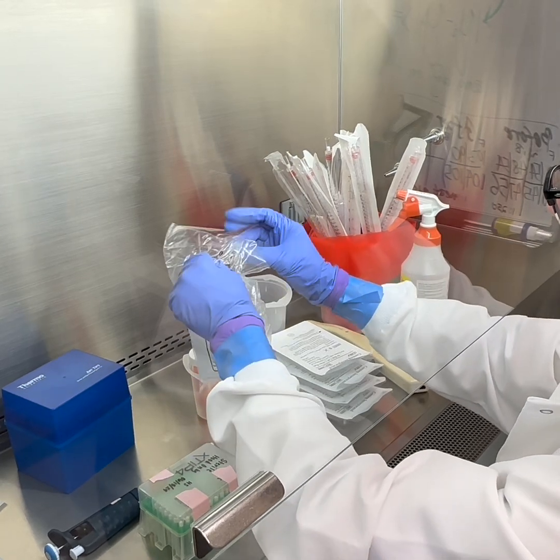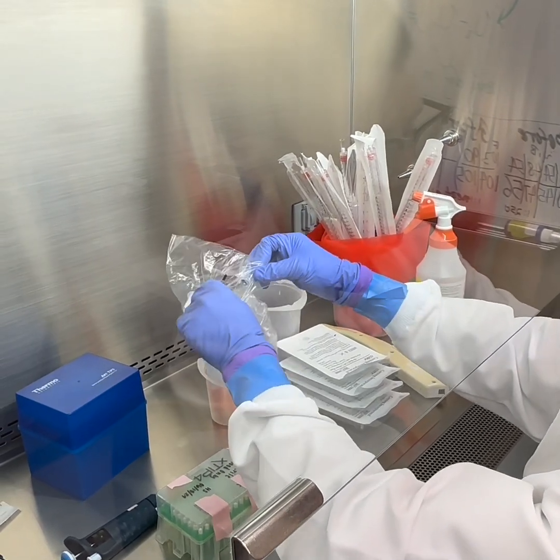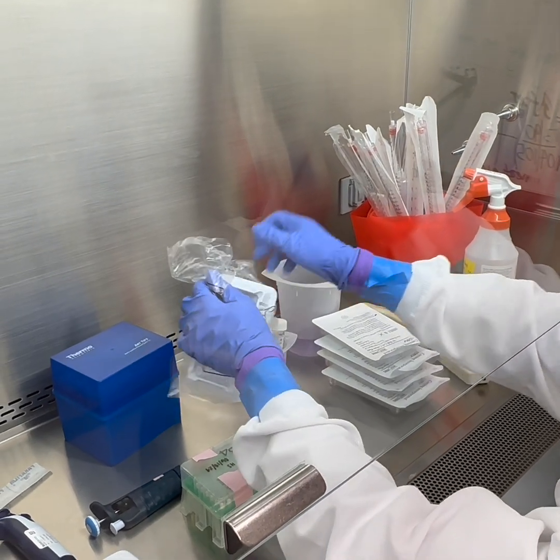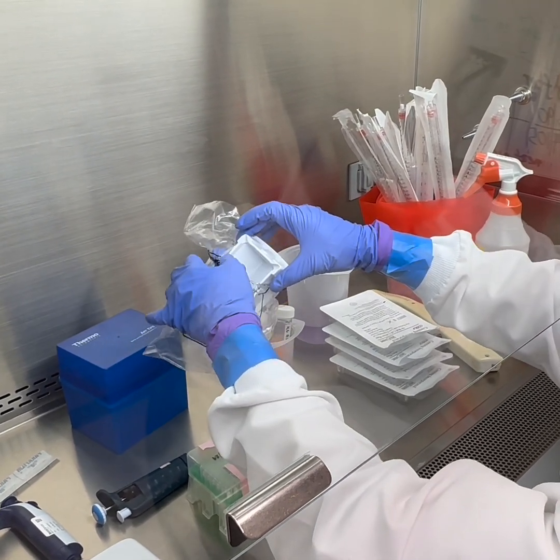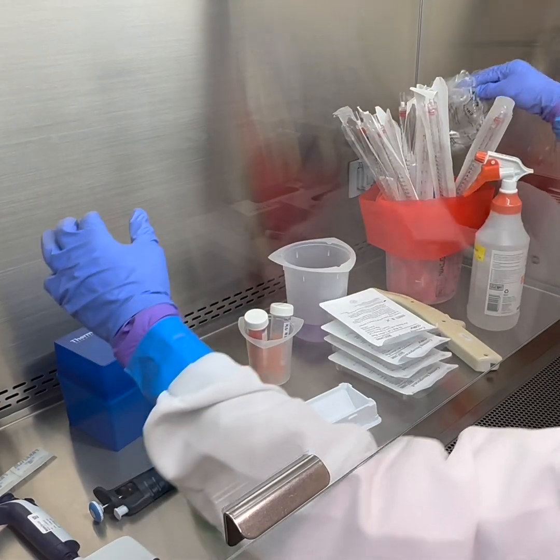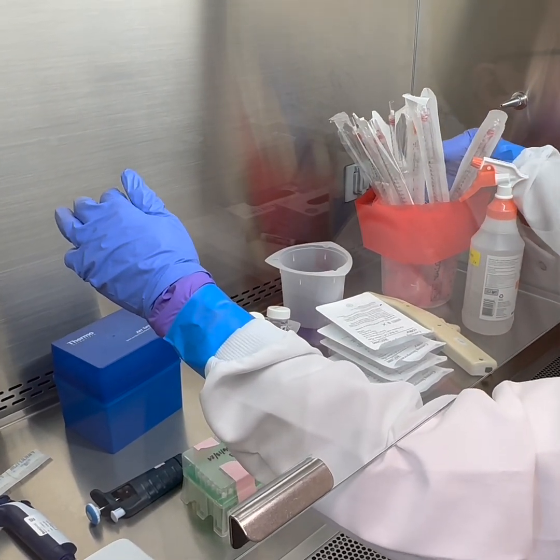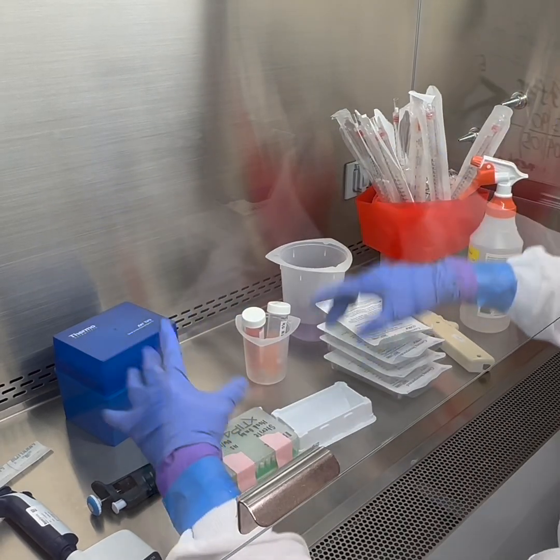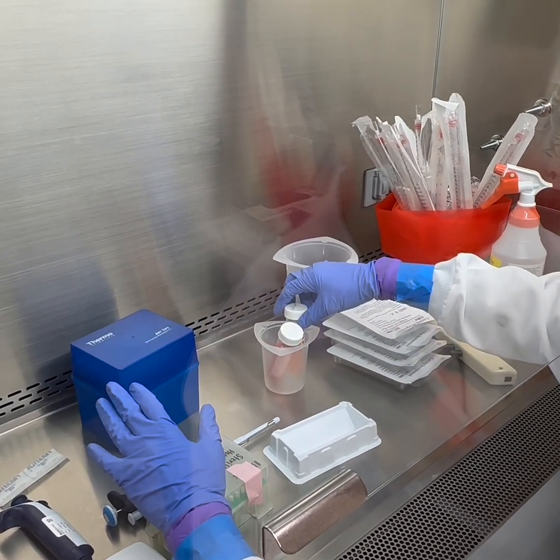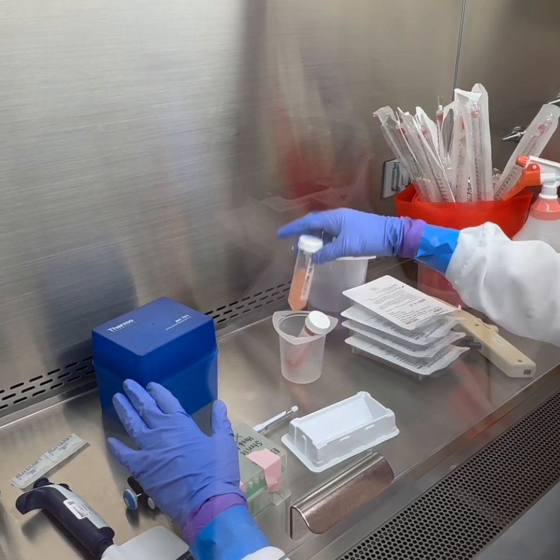All right, so Hannah has done the math and prepared the right suspension of cells, pretty much exactly 1 × 10⁶, so she did a really good job, but it just has to be roughly around there. We're doing 4 plates, so we made 40 milliliters. We don't need this anymore.